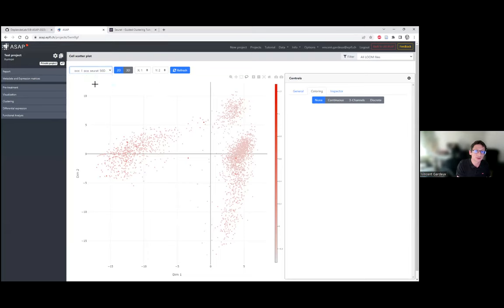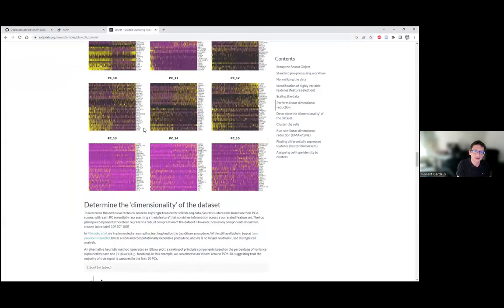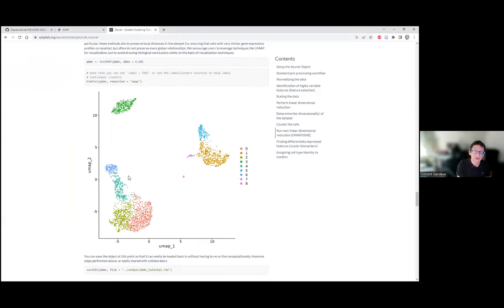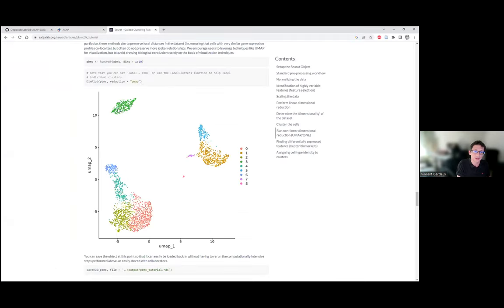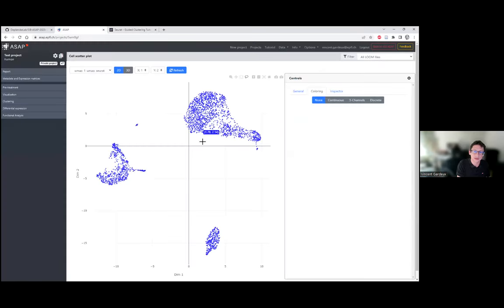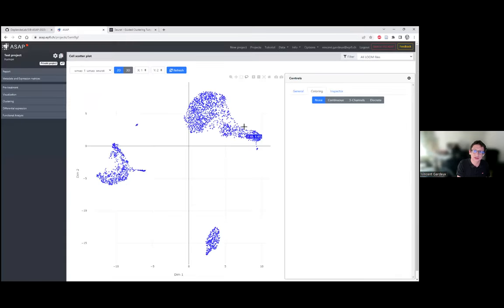And if you plot the UMAP with 10 PCs, so the first UMAP, you can see that it's also similar to what you have here. You have this little cluster here, that is probably this green cluster. Then you have this cluster with the little thing here, which is this one. You have this very lone cluster here, which is this one. And then you have this bottle-shaped cluster here. Very specific term, bottle-shaped cluster. But yeah, you get that.